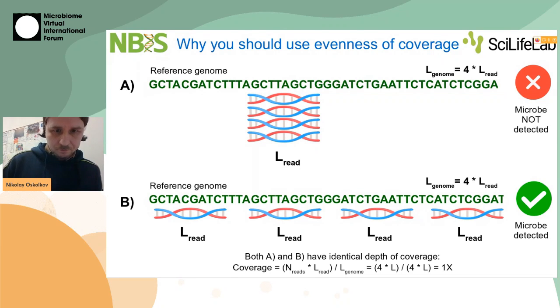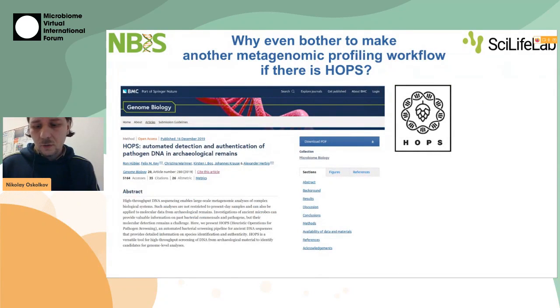So that's important. And that was about aMeta, but also if you follow this field, if you're into the ancient metagenomics research field, you probably can say, so what about other tools? Maybe there are other tools. And yes, there are other tools. I wouldn't say there are many tools, but there is maybe one or two other tools in this research area.